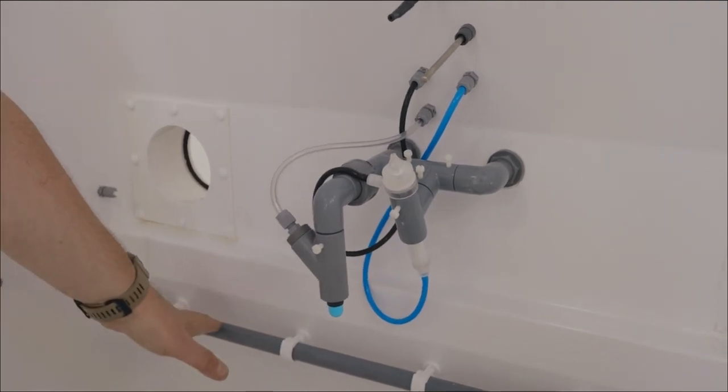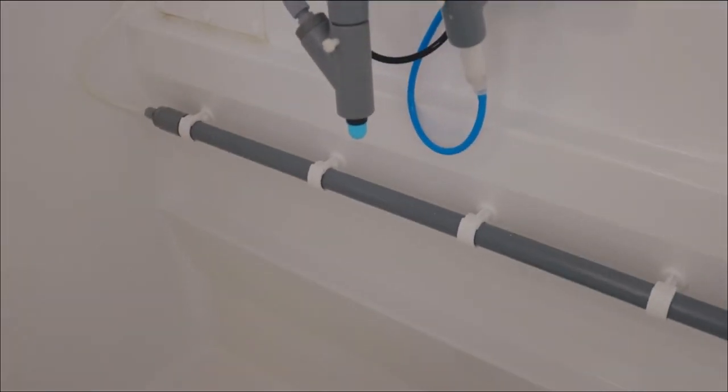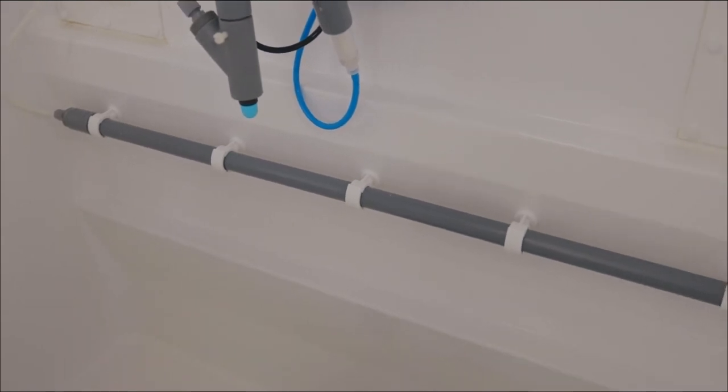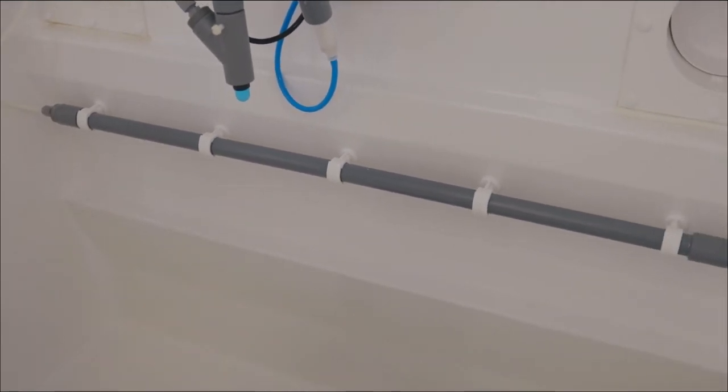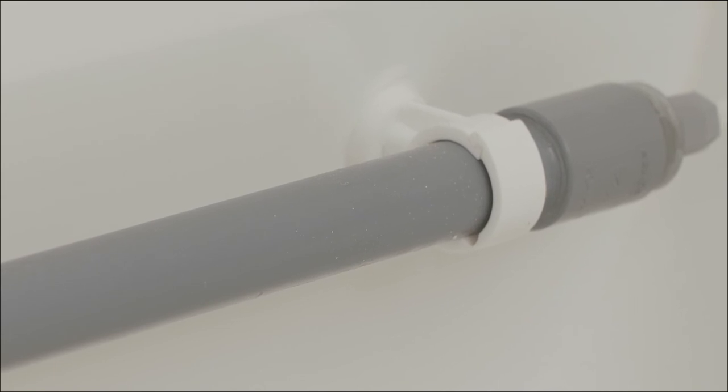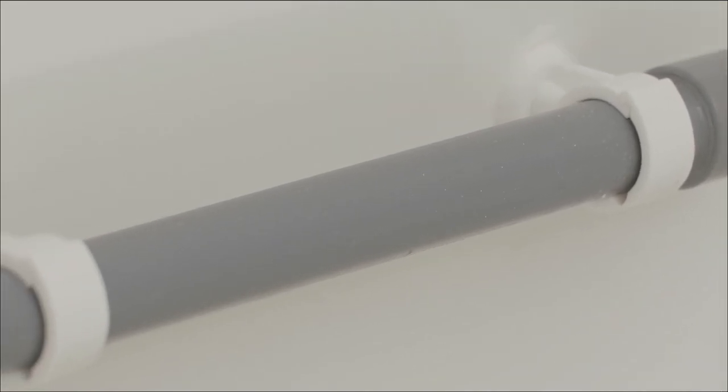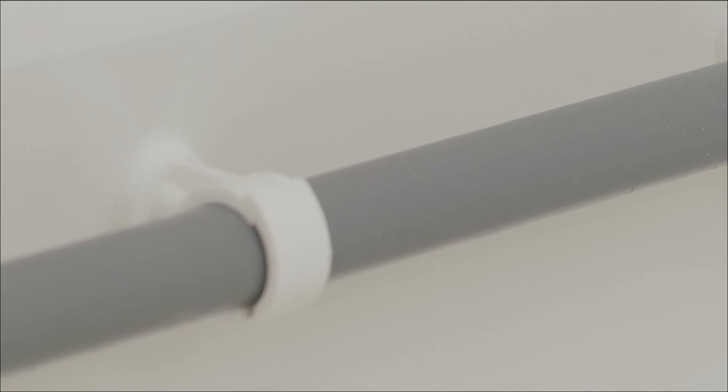Below this we have an air distribution bar. This is used to inject compressed air into the chamber during purge, air drying and controlled humidity modes and circulates that compressed air around the volume of the chamber giving an even temperature and humidity profile.